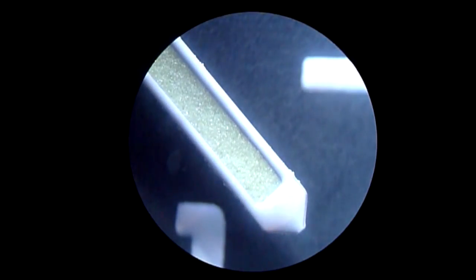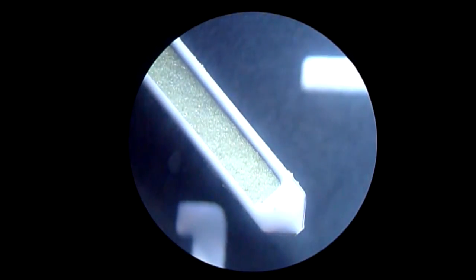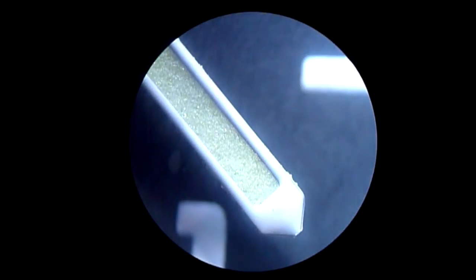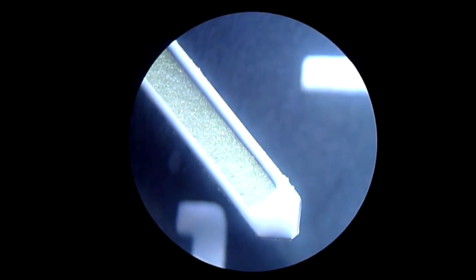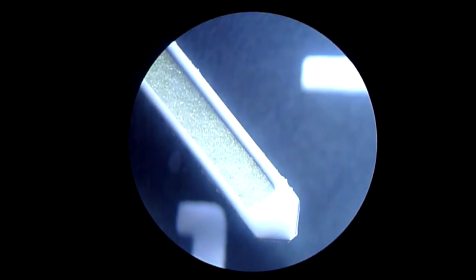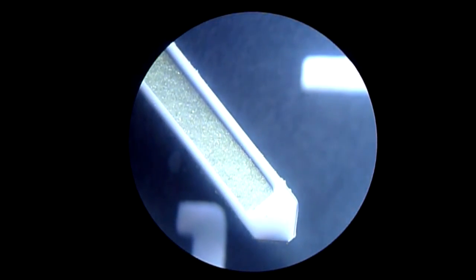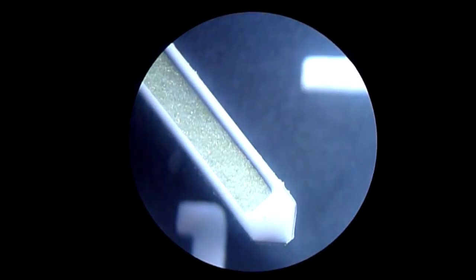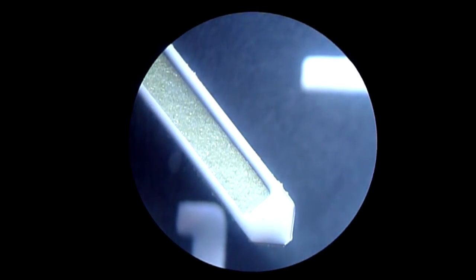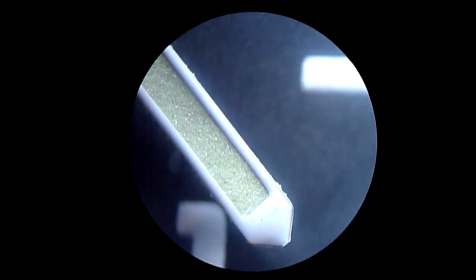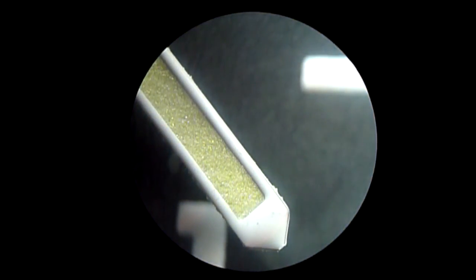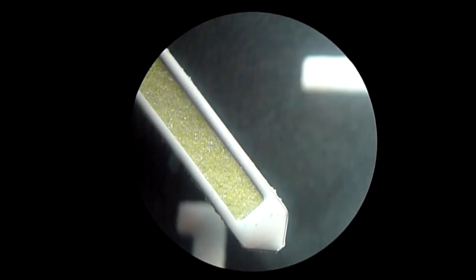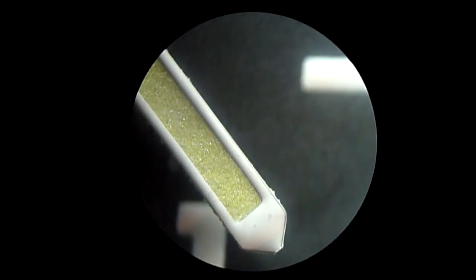Here, look at this. The minute hand is, you can see the minute hand moving, vibrating as each second goes by in your life. Your life runs away. I hadn't noticed that with this watch. It's really a good quality watch, only a couple hundred bucks, but it's a beautifully made watch I think. Wenger is a great brand. You can't really see this movement much under the naked eye, but it's bloody huge at this magnification.